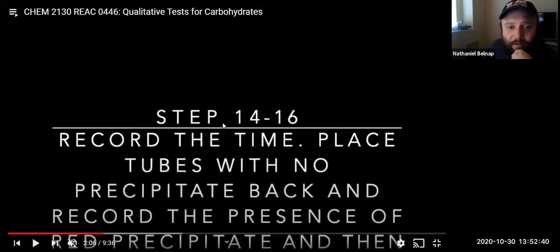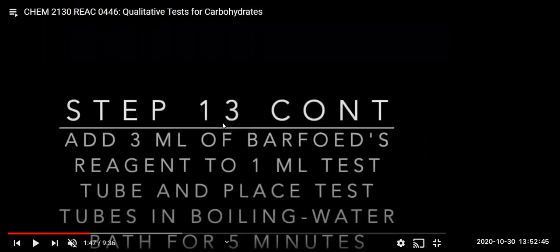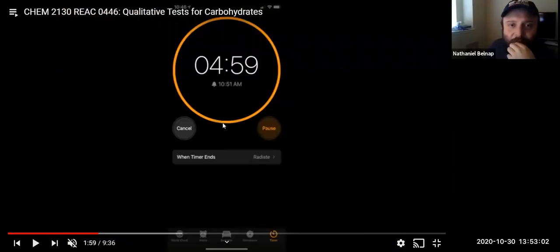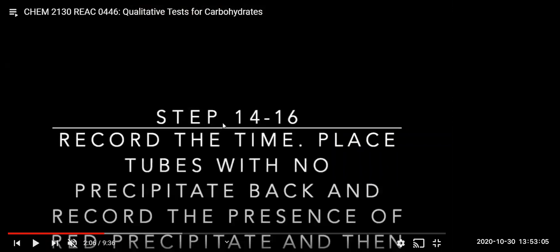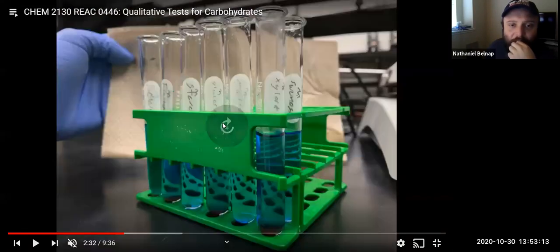From my understanding, he did it for 10 minutes. So where do you see 2 to 3 minutes? Well, I was looking at what the results say. We should have a red precipitate within 2 to 3 minutes if it's a reducing monosaccharide, and we should see red precipitate after 10 minutes if it's a reducing disaccharide. Okay, yeah, because there was no 2 to 3 minutes. It was just 10 minutes. So basically if we saw a red precipitate at all. Yeah. He does it for 10 minutes, so this is after the total 10 minutes here.